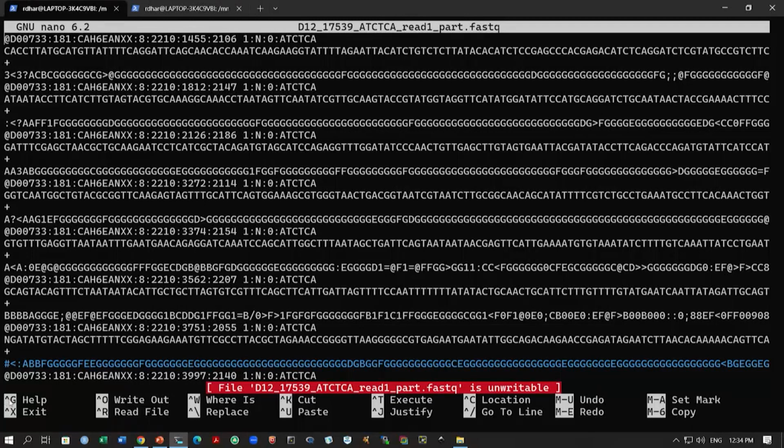These are certain options and how you run them. Here for example, we have this x. You see this sign, but it actually means control. So, you have to use control plus x to do this. If you want to exit, you have to do control plus x. If you want to write out, or read, it is control r. If you want to cut or paste, you have control k, control u, and many different options.